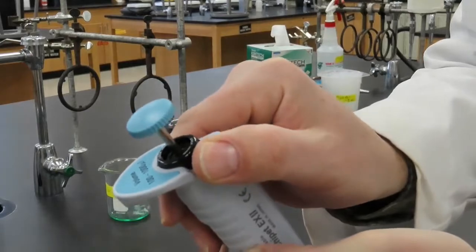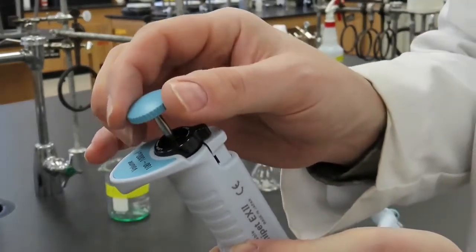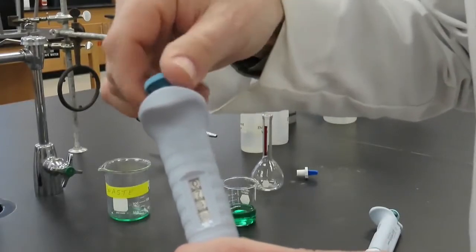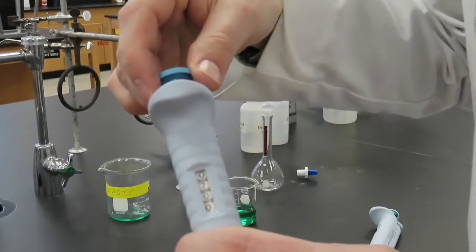For the smaller pipette, we follow the same procedure. Unlock the locking ring and adjust the volume by rotating the plunger. Now it is set at 700 microliters.